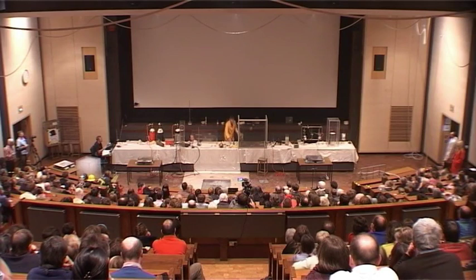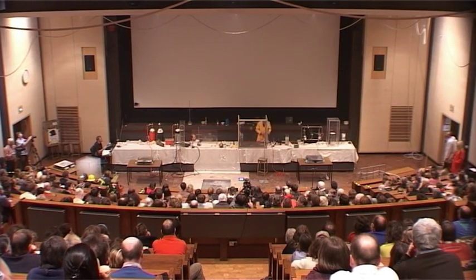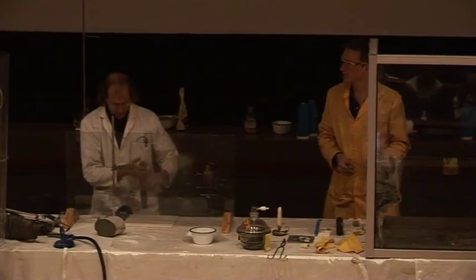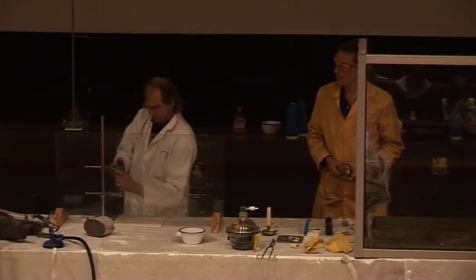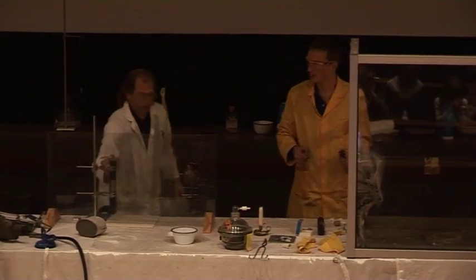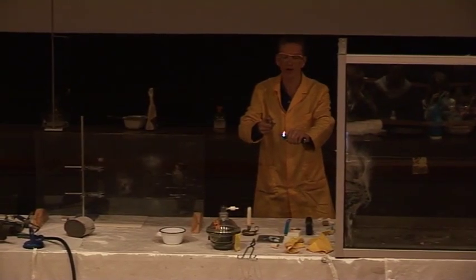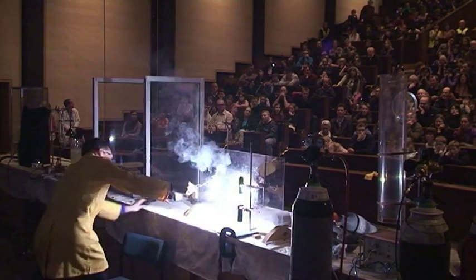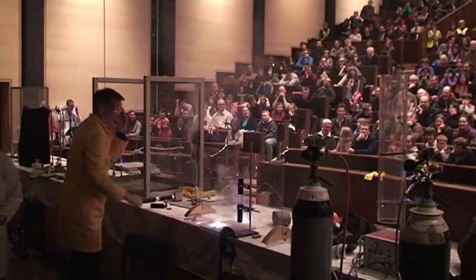Okay, just need to find my magnesium, my tongs, my burner. Can I have the lights down, please? So we don't want it too bright, because otherwise it will start. Okay, so before we just had it gently burning. If we mix the gases in just the right ratio, we should be able to get a bit of a bang. So I'm not going to put this burning magnesium into it, just going to hold it near the tube. And there we are. We get a nice bang from that. Can I have the top on?